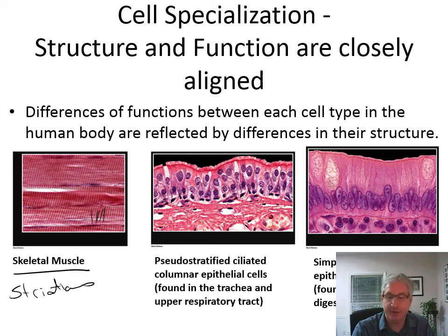All right, so what you visually see, you have these stripes going all the way down the muscle, and those are actually proteins. They're there and they've stuck together, and so where they come together, it's a little bit darker. So there's a little stripe, there's a band there. Okay, so the proteins aren't like this; they're actually like this, and so when they come together, it makes little bands, and those pull against each other.